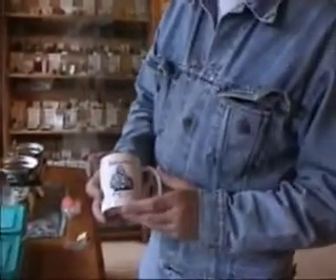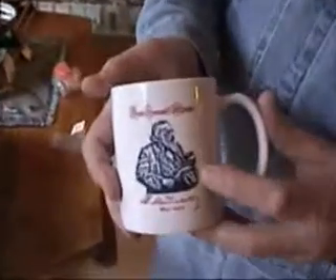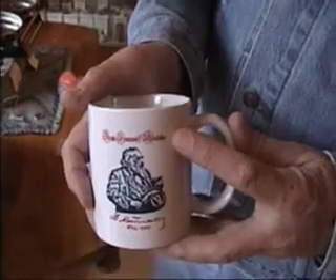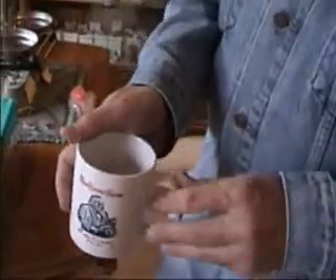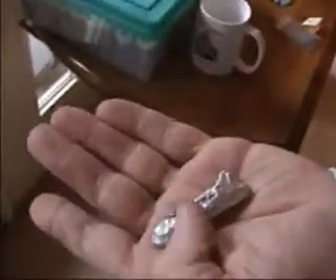For elements representing Mendeleev's discoveries, we're going to use a cup bearing the likeness of Mendeleev, because we're going to use this cup to heat up some gallium. Here is a sample of metallic gallium. We protect it to keep it from oxidizing. And this is a solid sample of gallium.